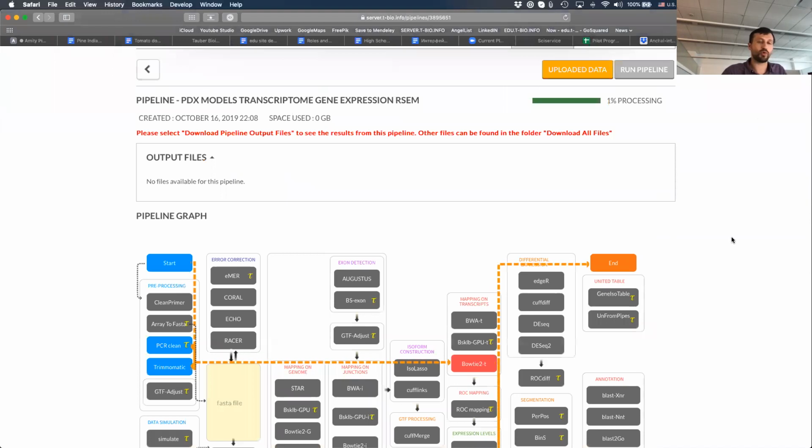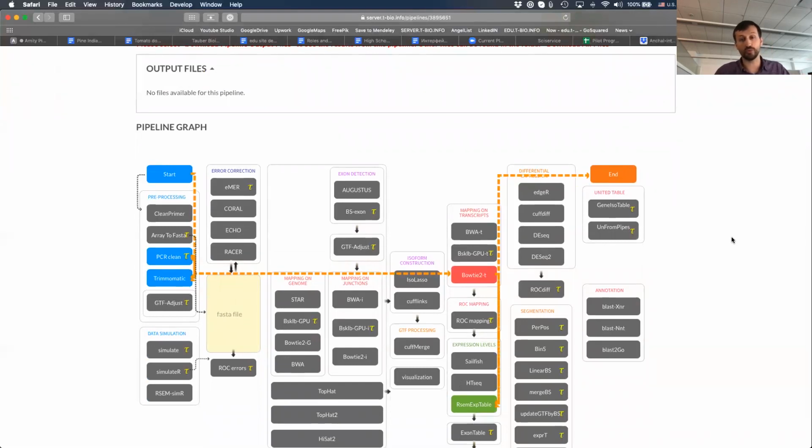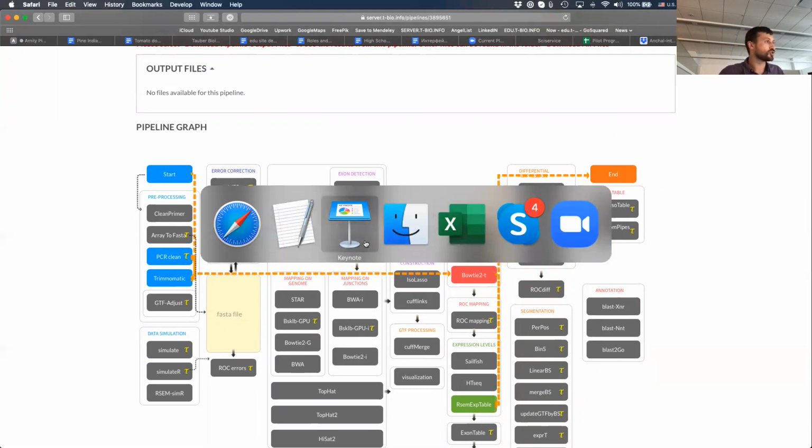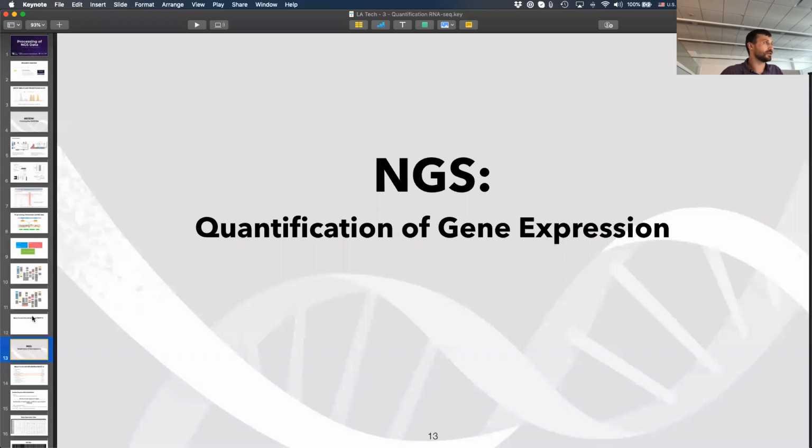As you progress in your learning, you'll have different types of pipelines to create. For example, now you can create two pipelines, right? One like this and one like the expanded one, and then you'll get points for both of them. So that's a little bit on processing this next generation sequencing data.